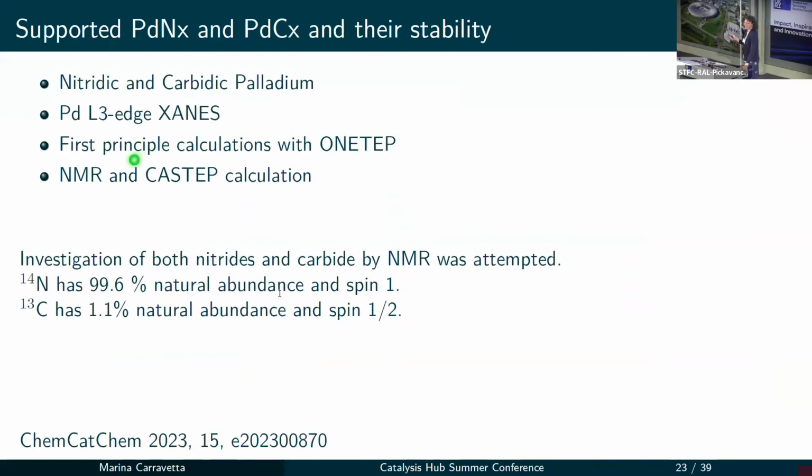When it comes to the palladium nanoparticle for nitride and carbide, we performed a study on both these species, and we did some XANES experiments.